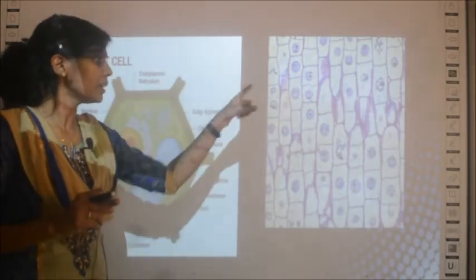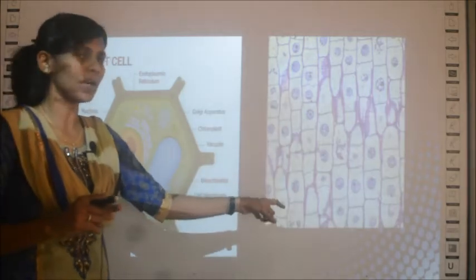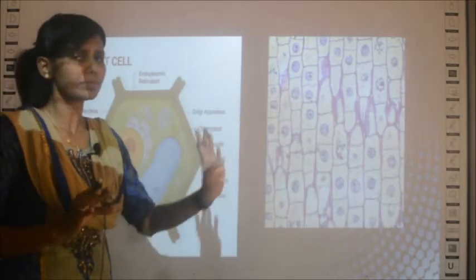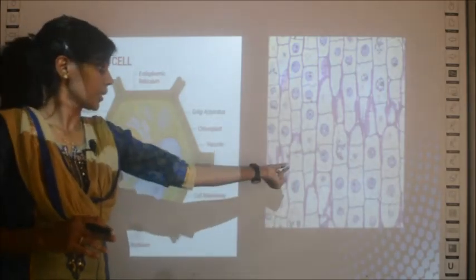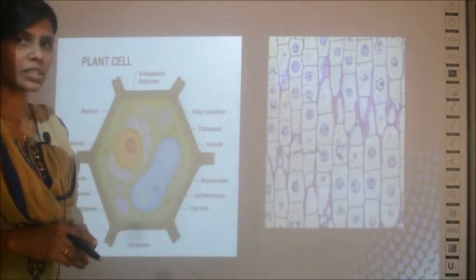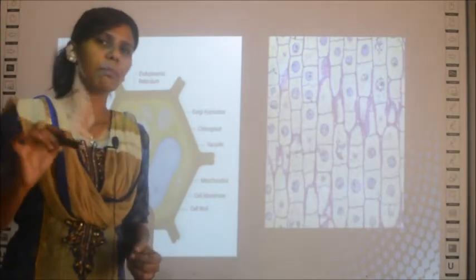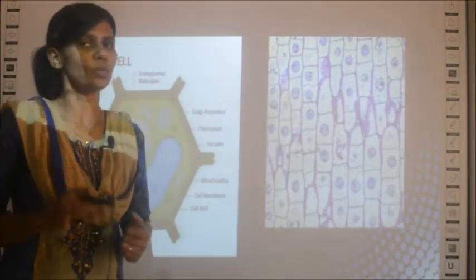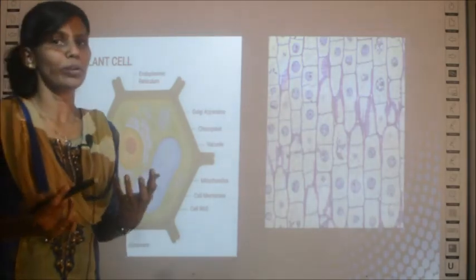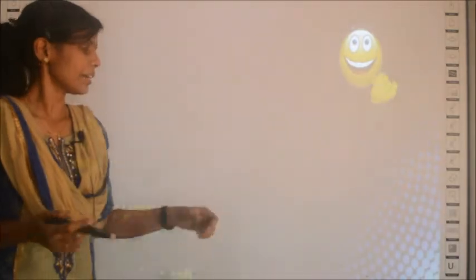That's why in the structure you see under the microscope, you can see only the nucleus and the cell wall. Okay, sometimes you can see the vacuoles also, but they are not stained, just like a big ball filled with water you can see. Maybe when you come to school, we'll observe this in real. I'll take you to the laboratory and show you.